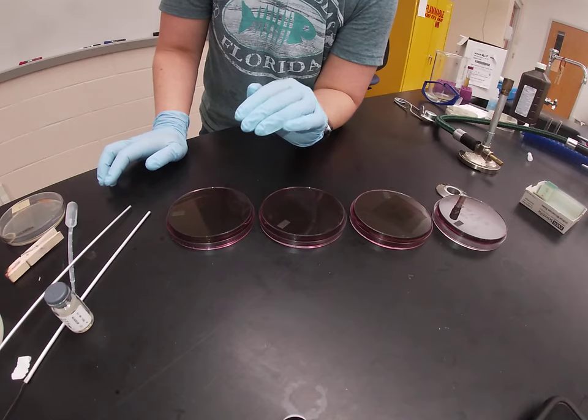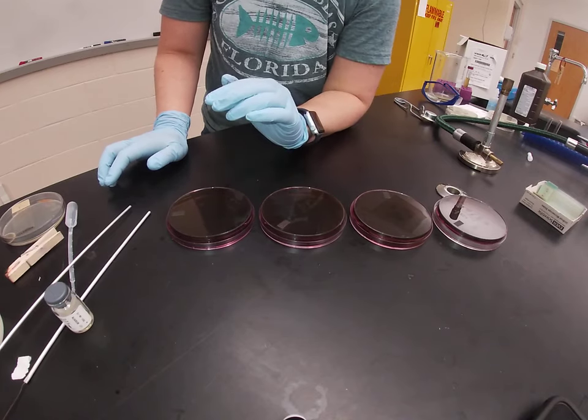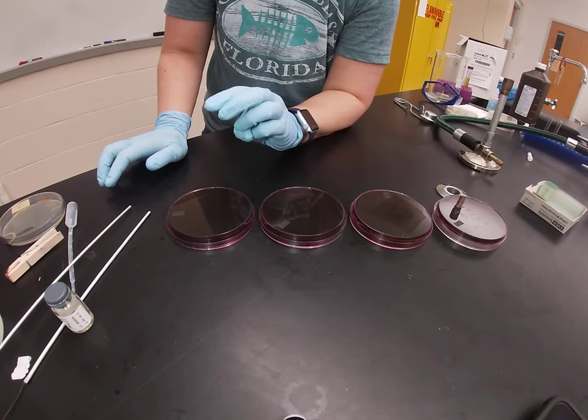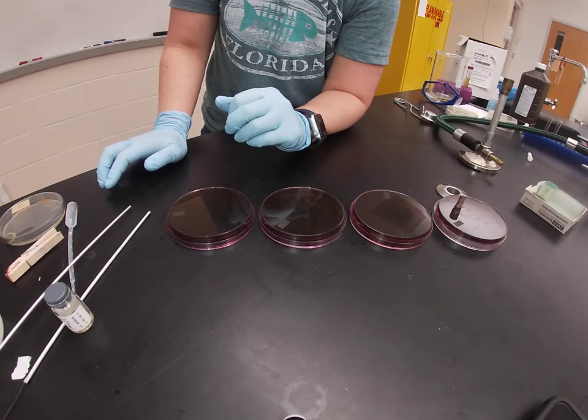EMB is differential based on the rate of lactose fermentation. In these plates we have lactose, and the presence of those dyes can also tell us how quickly and how vigorously the organisms are able to ferment that lactose.